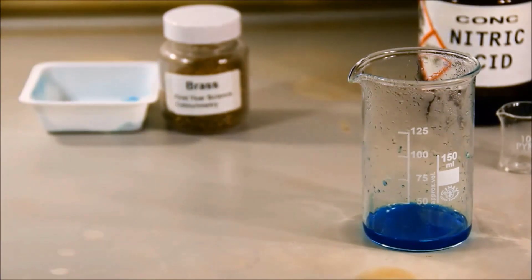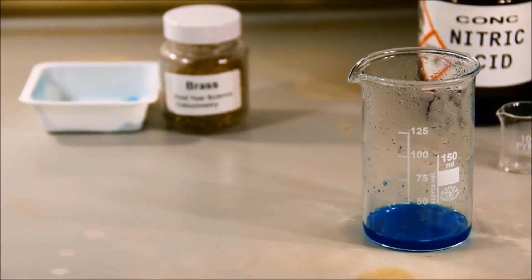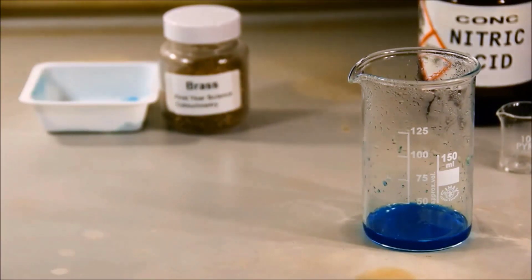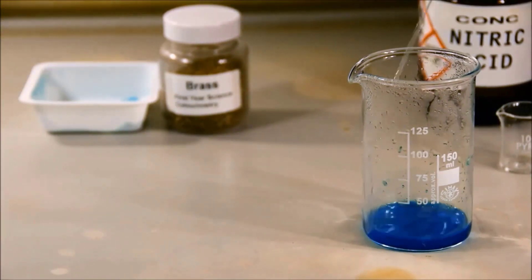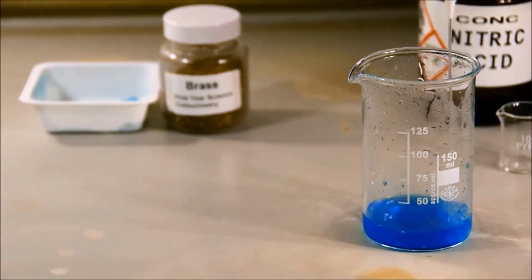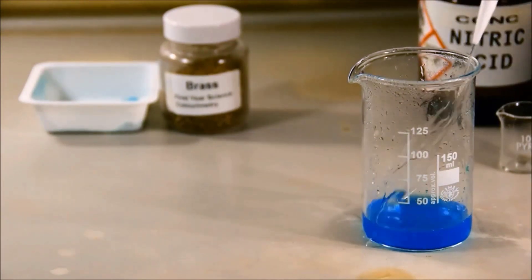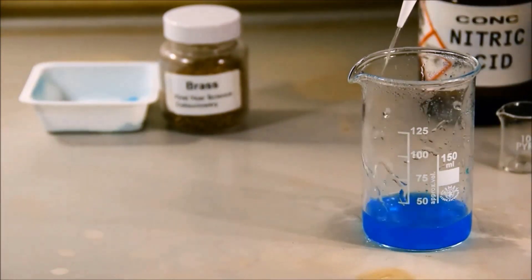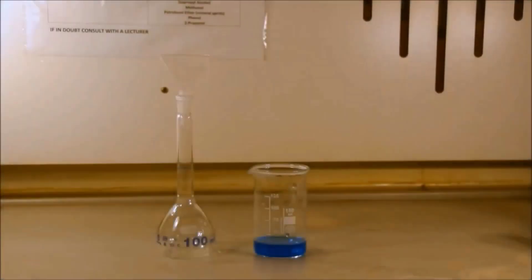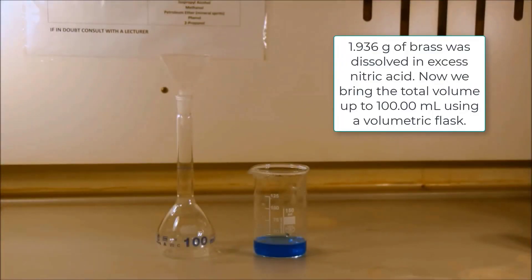The copper²⁺ ions in solution have a blue color. The gas produced was nitrogen dioxide, which is very poisonous, so we had to do this in the fume hood.